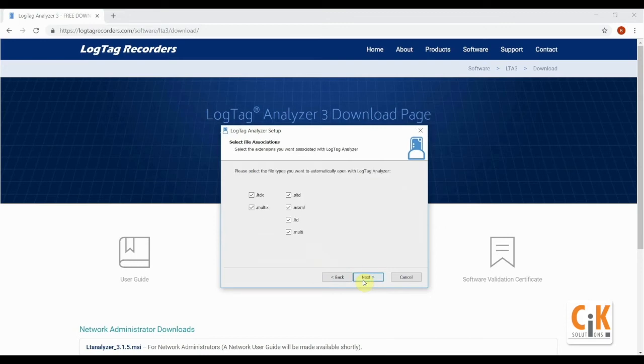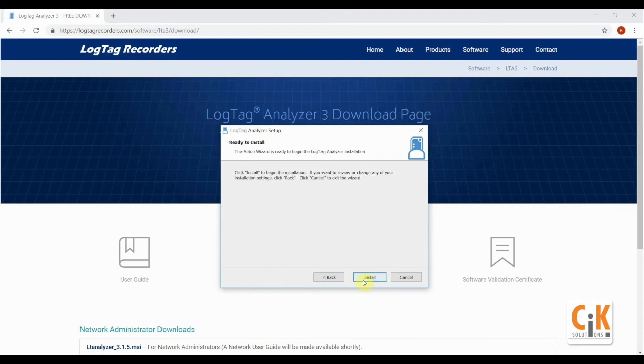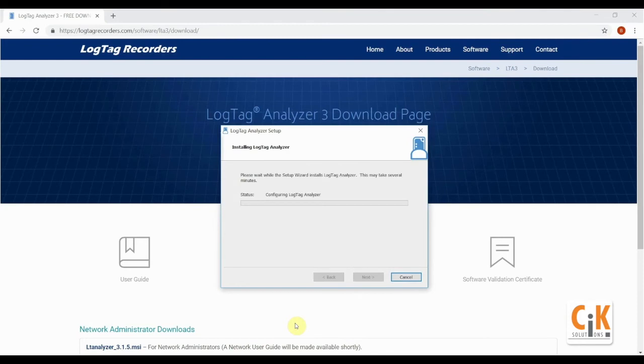We recommend keeping all file extensions ticked as they are only used by LogTag Analyzer and click next. Finally, install to commence installation with the settings you've chosen.